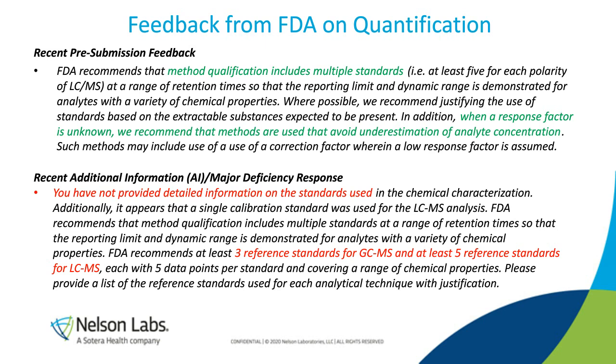Okay, and then they also say when a response factor is unknown, we recommend that methods are used that avoid underestimation of analyte concentration. So this type of feedback, I think, is spawned from just a few bad examples where maybe some quantifications were made in the past by labs without really using a lot of expert scientific judgment. So it is possible, if you are careless, to do this process in a way that isn't very scientifically valid. Some of these examples have made their way to the FDA. They don't like these types of surprises, and so now they're asking for all this additional detail and information.